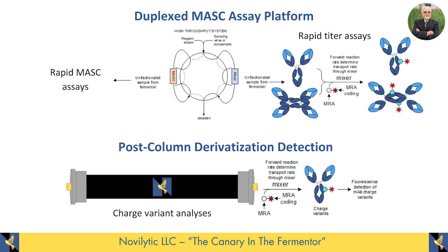So anytime that you have a test tube and we put that coating agent in a test tube that has antibody in it, the fluorescence will increase. And that is terribly valuable, because now it says that in a test tube that has 2,000 or 3,000 proteins, one of which is your antibody, if you throw in the coating reagent, the fluorescence will increase, and that total increase in fluorescence will be just due to your antibody, nothing else. You don't even have to do a separation. And so there are multiple ways that you can use this system.